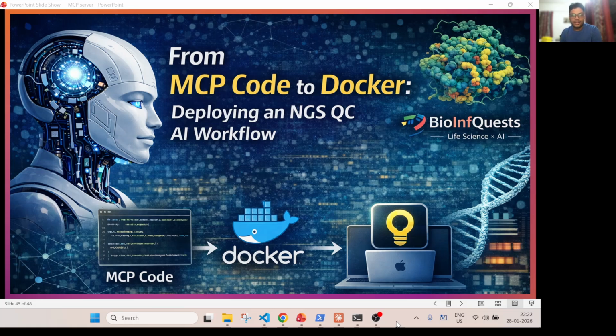Hi everyone. In this video, we will explore how to package our MCP code in the form of a Docker and then launch an MCP server via Docker. Docker is a very important, nice way to package our MCP code so that it can run anywhere, independent of the platform. All the advantages of Docker, we can get. So that's what this video is all about.